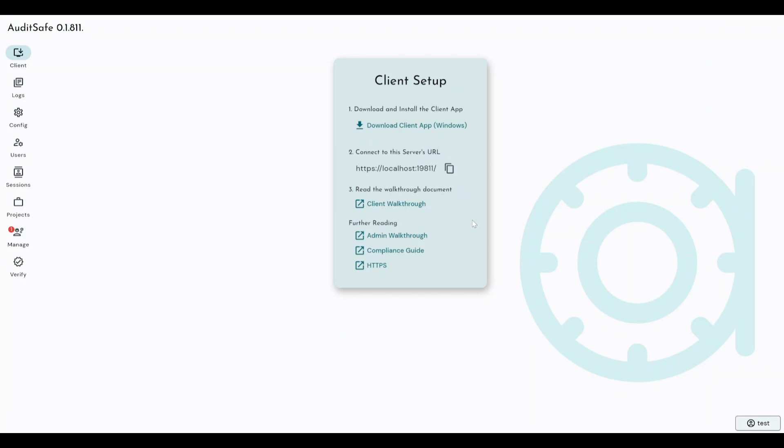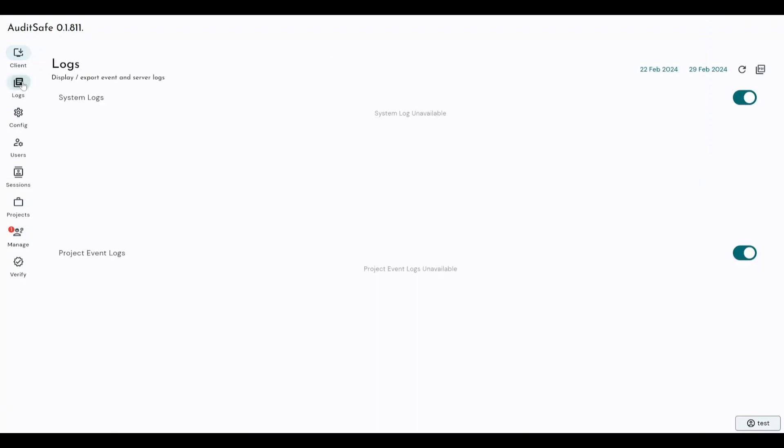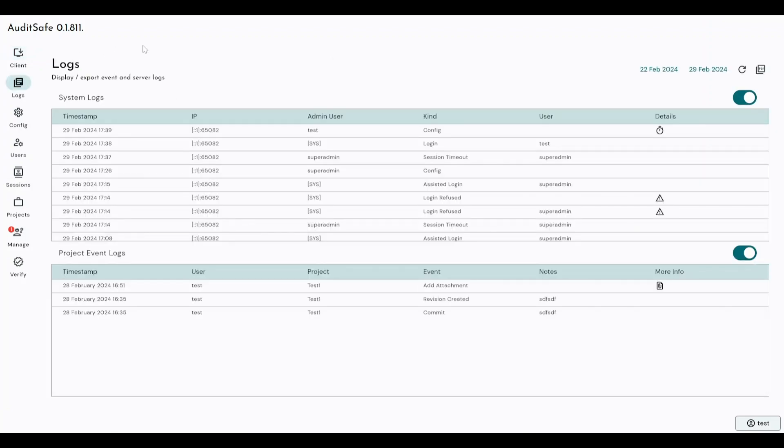Now what we also provide to users is a certain number of walkthroughs and guides as to using the software, which again will be a text version of this video. So the first option we've got on the left hand side here, once we've logged into the configuration, the admin side of the software is logs.